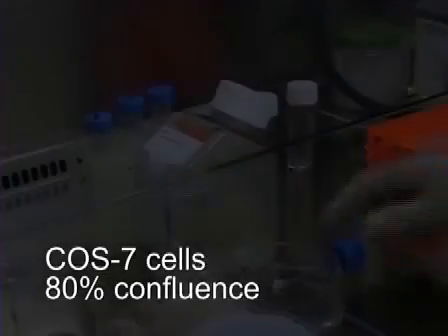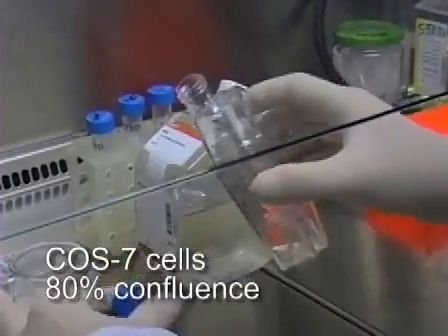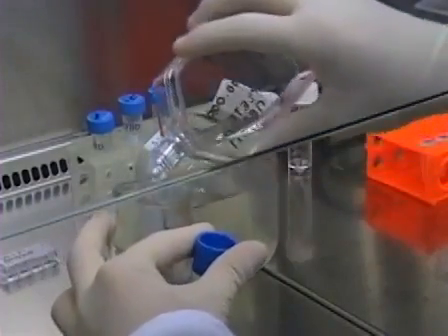The first step of the experiment is the preparation of the sample. We work on live cells without antibiotics. Here we use COS7 cells, which endogenously express EGF receptors.